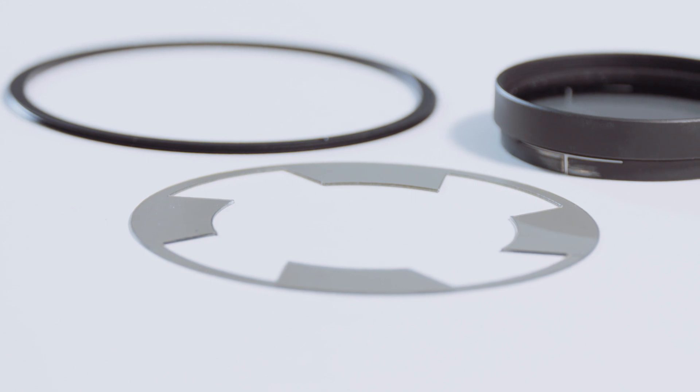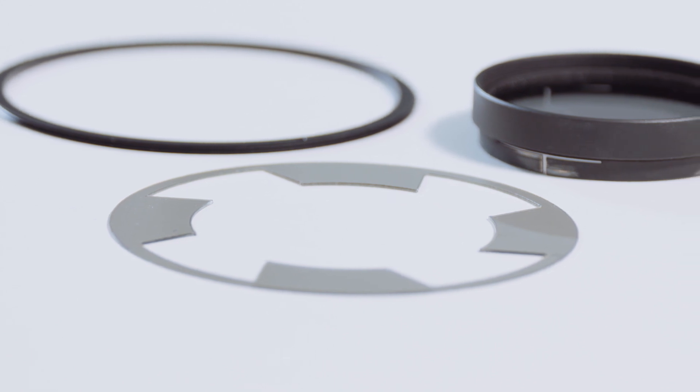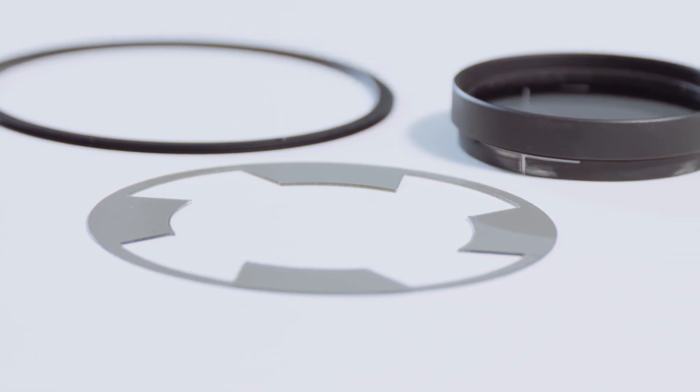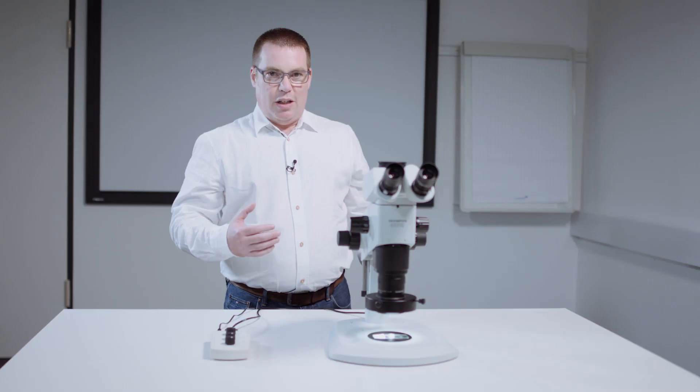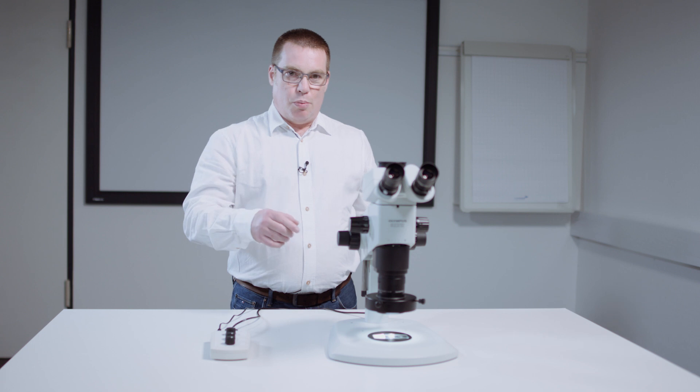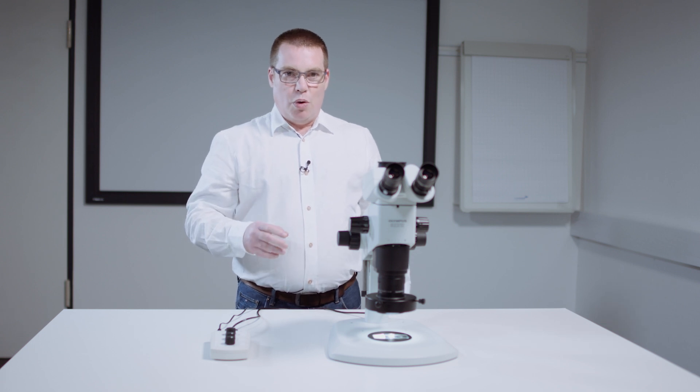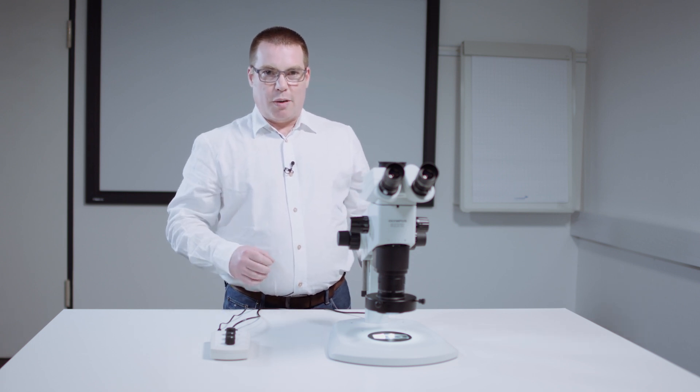In contrast, our segmented pole filter set uses a fixed segmented polarizer, which is arranged so that the light either passes through the polarizer when the ring light is illuminated by an eighth segment, or goes directly onto the sample after switching to a segment without a filter.